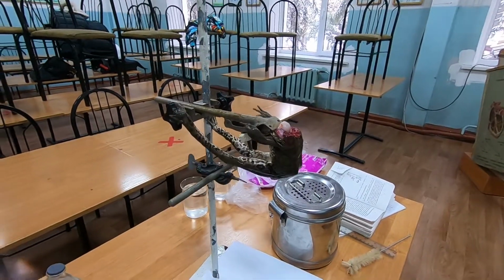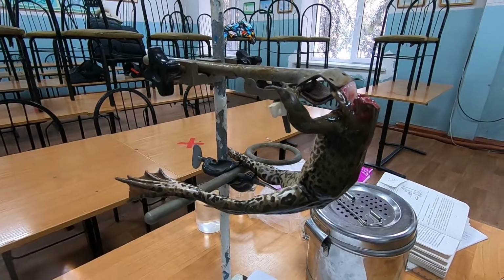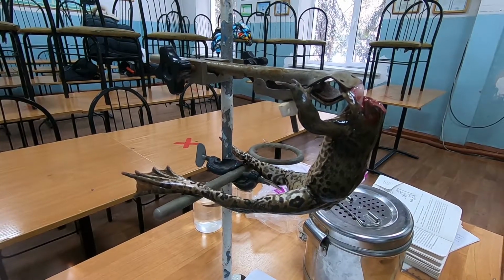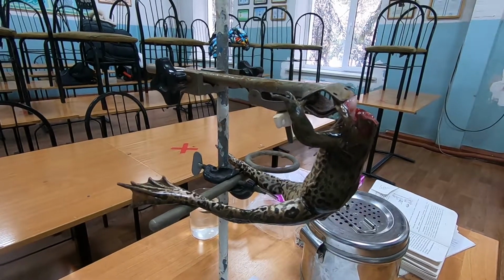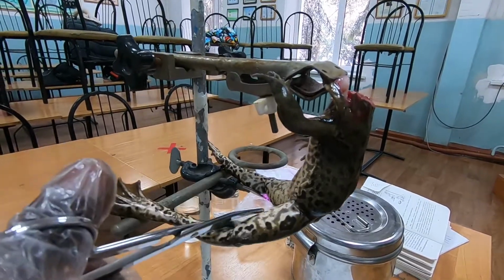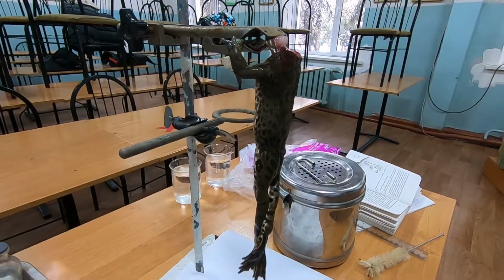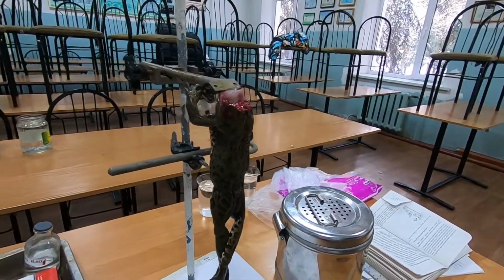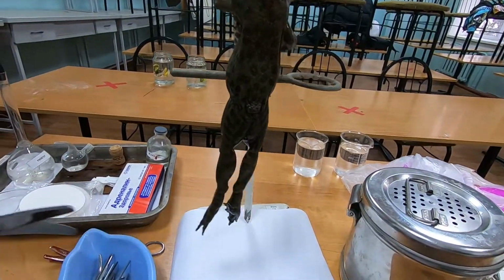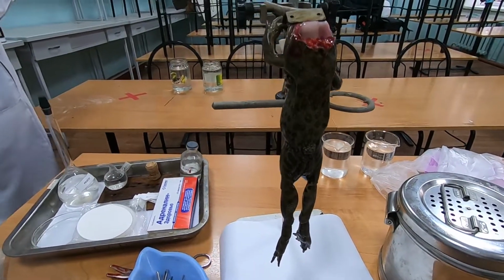Okay, students, you can see it has regained its sensitivity. Now it's feeling a very horrible pain. So the shocking condition has already expired. You can see it. The movement shows us that the frog is not yet dead. And now we're going to begin our experiment with it.